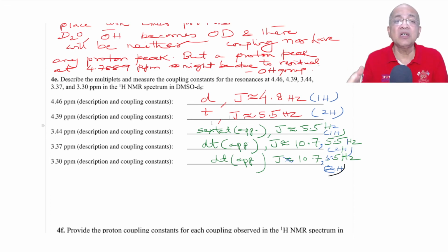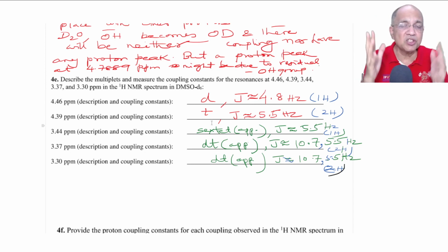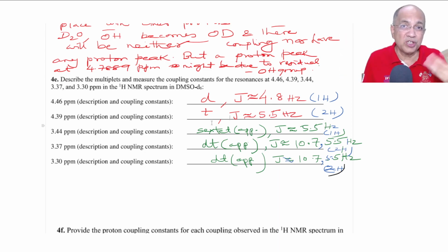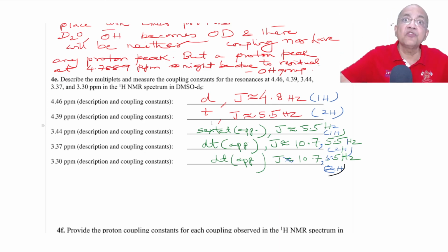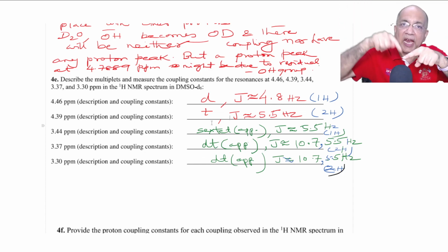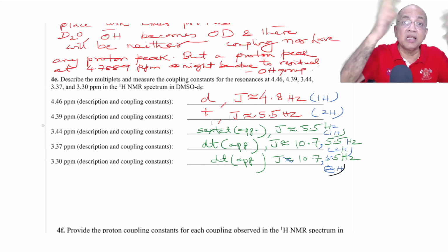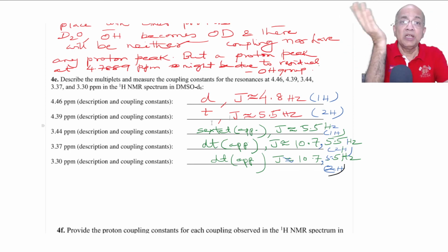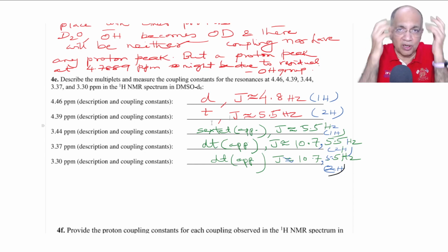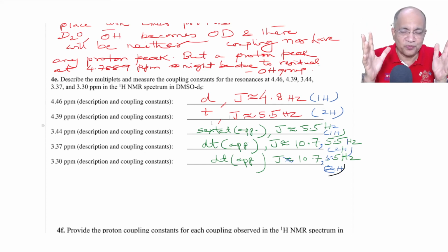Whenever you solve a problem with spectral data and analyze the J values with multiple J's, J2, J3, and the J3 values are different, you found in the first case that JAB and JAC were not the same. Therefore, the nine lines came so close that they interchanged at two places, and we had to use a little bit of intuition to segregate which one is which.